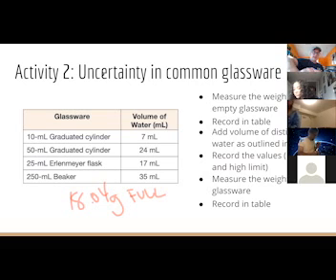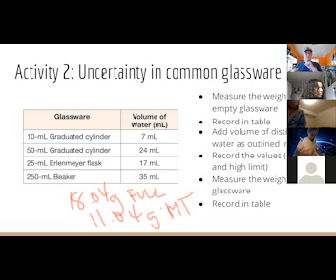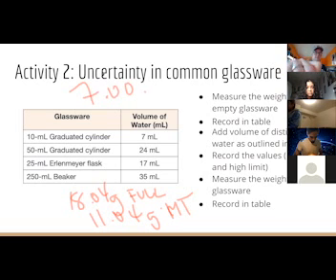So empty, it is 11.04 grams. So the difference is going to be the mass of my water. And so nicely for me, the mass of the water turns out to be 7.00 grams, which is pretty darn close to what it should be, right? Should be around 7.